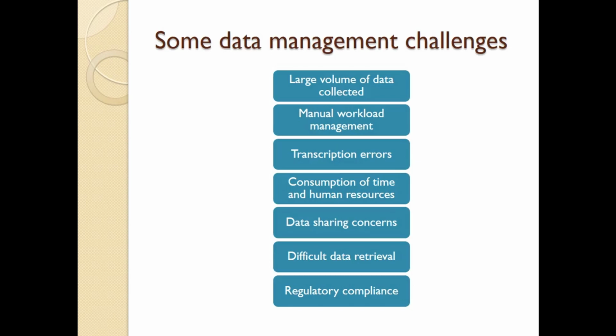We normally transcribe equipment usage, balance usage, or any key piece of equipment that was used during sample prep, we transcribe that into our logbooks, as well as any reagent prep or sample prep or standard prep information.